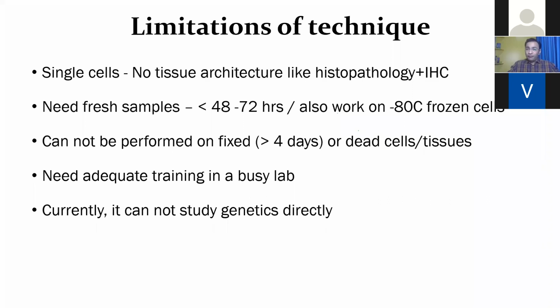You cannot use formalin fixed cells, because many times the protein structure is altered by formalin, and you do not get good results. Then you need adequate training. So all flow cytometry labs and technicians, I'm repeating, technicians, are well trained.